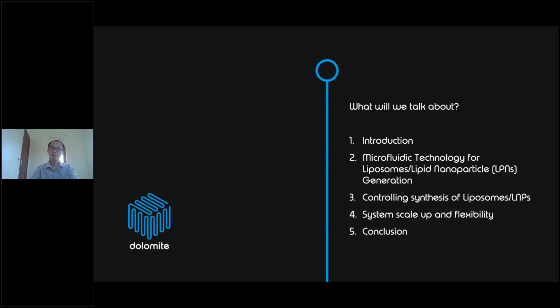The content of today's presentation will include the introduction and the microfluidic technology for liposome or lipid nanoparticle generation. Then we will learn about controlling the synthesis of liposomes or lipid nanoparticles, and system scale-up and flexibility, and finally the conclusion.